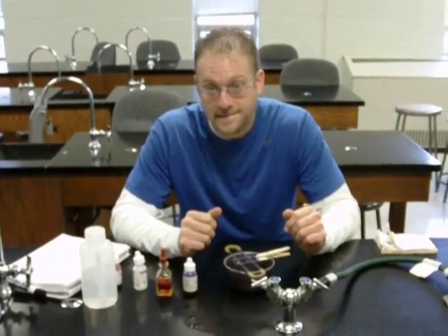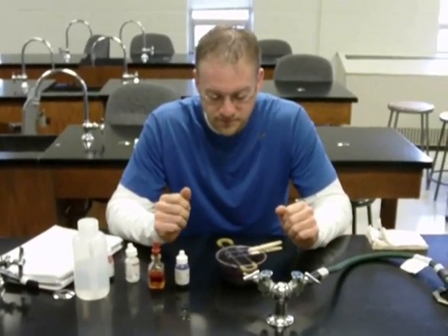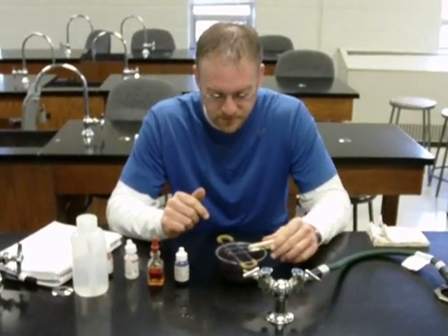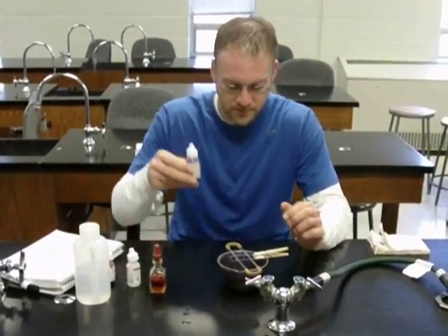I am here with Jason. He's a current microbiology student of mine and he's going to demonstrate the gram stain technique. He's already heat-fixed a specimen and he is going to begin by adding the crystal violet to the specimen.